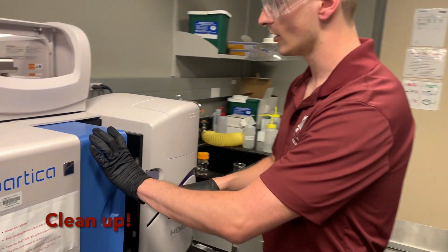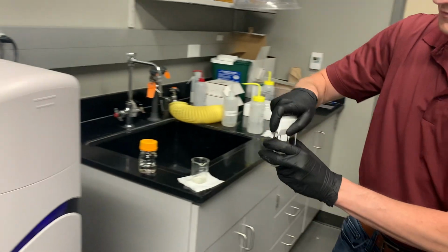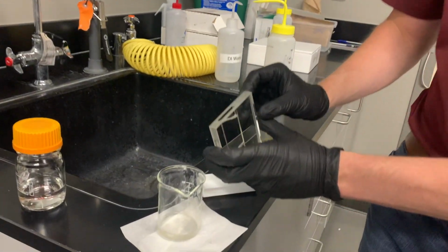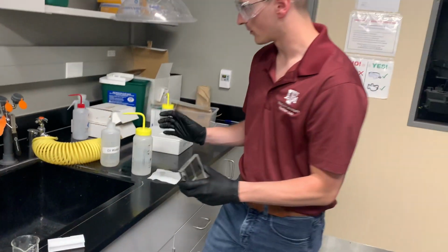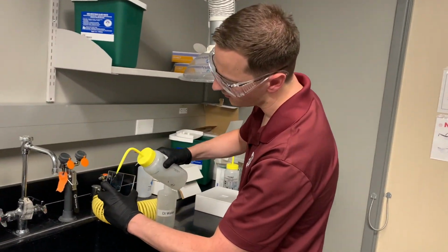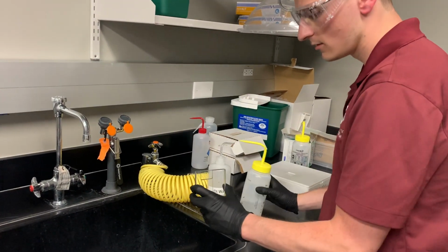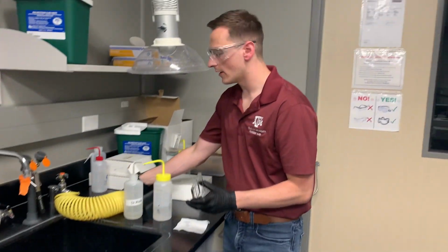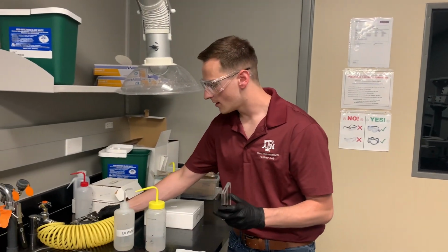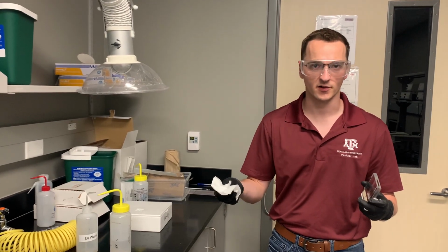So now that we've collected a measurement, the final step is to clean up. So we can go ahead and remove the fraction cell from the instrument, pour the contents into this glass beaker, like so. And to prepare it for the next user, we're going to want to clean out the inside with isopropanol. We dispose of that like so. And then we can go ahead and dry it using this pressurized air. And then again, wiping the outsides with a Kim wipe just to ensure that it's ready for the next user.